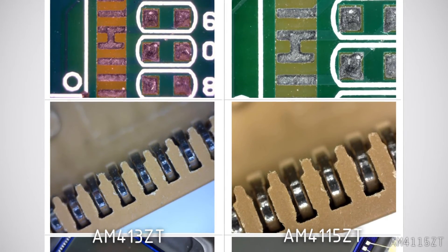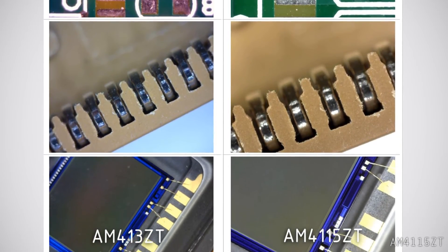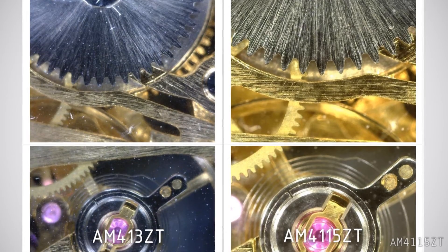This is a comparison of the AM4-115ZT and the Dino-Lite Plus/Pro.